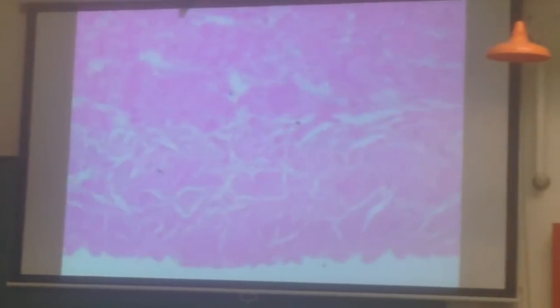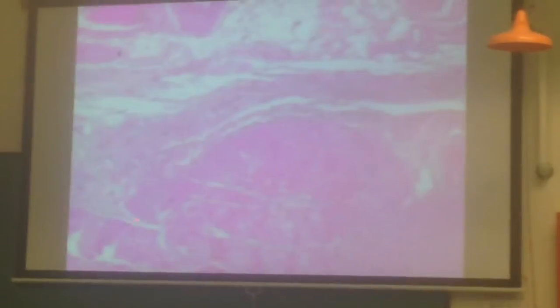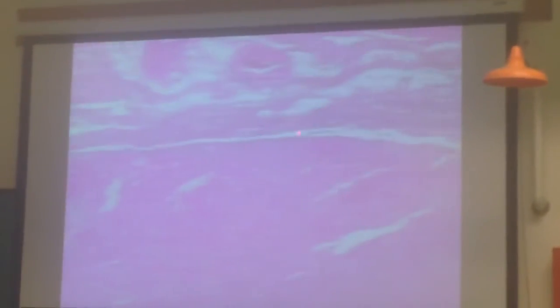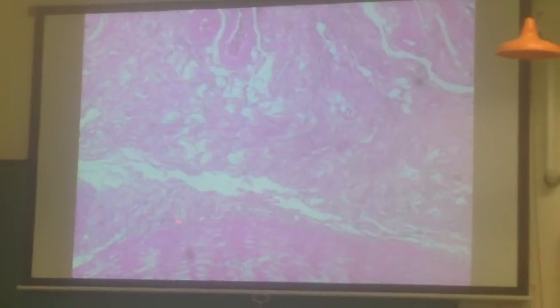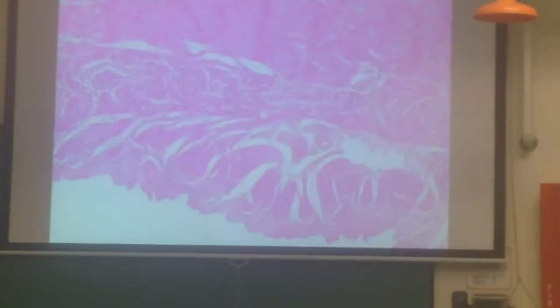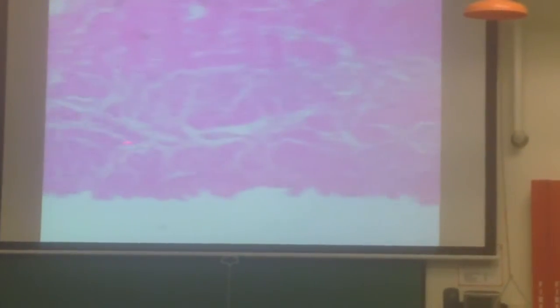Yeah, so when we look down here, the oblique muscle, this is the oblique right here. Let me see if I can focus a little better. You can see the oblique muscle sitting up into the submucosa, hanging out through here. And as we go down, you'll see circular versus longitudinal. Right here is circular, and here's longitudinal. You're just looking for big gradient gaps occurring.